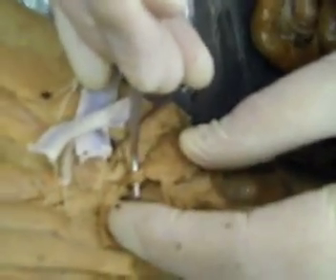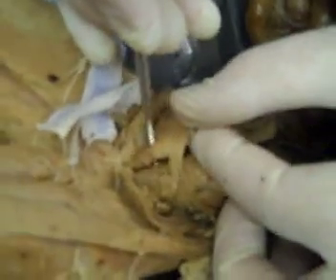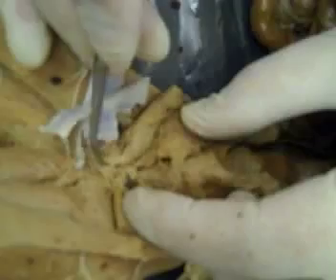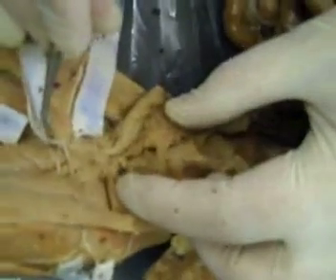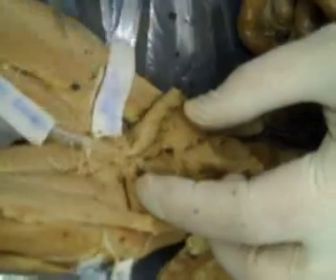And we never finished the urinary system. Here's the bladder, and this tube is the urethra. That carries urine out of the bladder to the outside of the body. This tube, the urethra, and this tube, the vagina, join somewhere down in here. But I would have to cut this muscle, and I'd have to cut through bone to see that. So the urogenital sinus is down in this region somewhere. It's the only thing we really can't see on your cat, besides the adrenal gland. Okay?